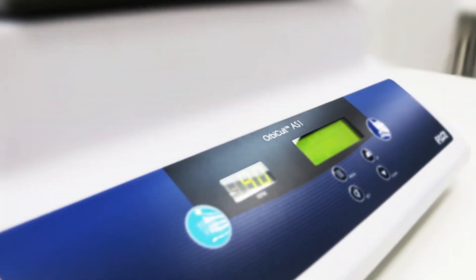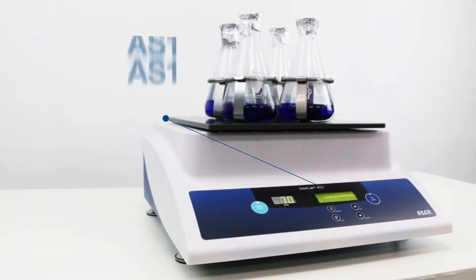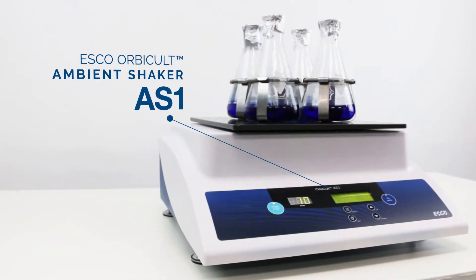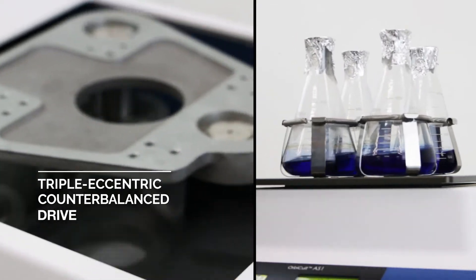Esco OrbiColt Ambient Shakers offer versatile models designed with outstanding features to provide reliable results. With its unique triple eccentric counterbalance drive that supports heavy-duty and high-speed applications.